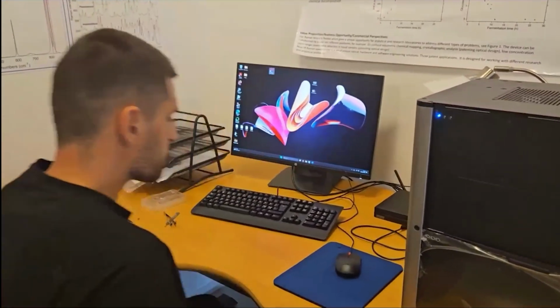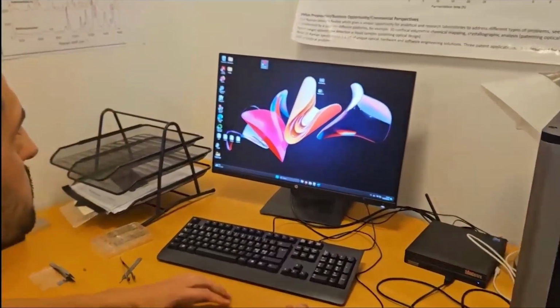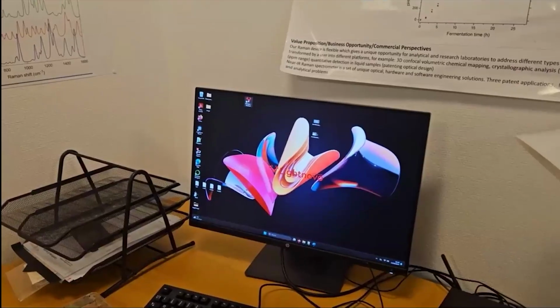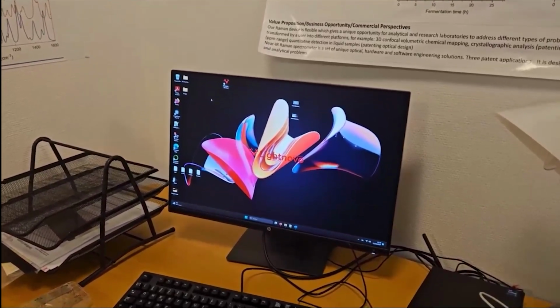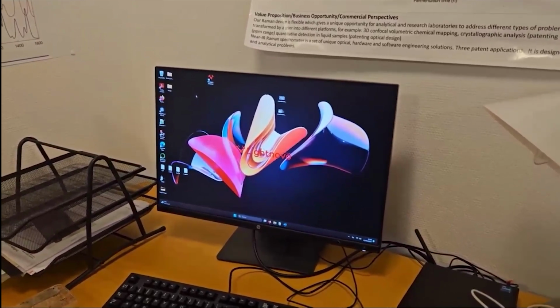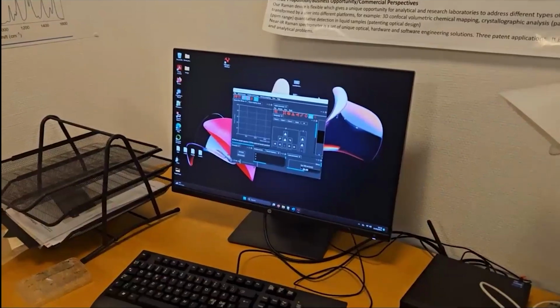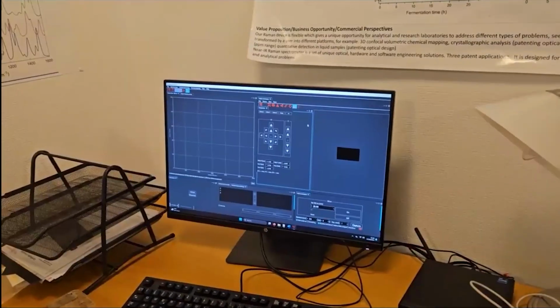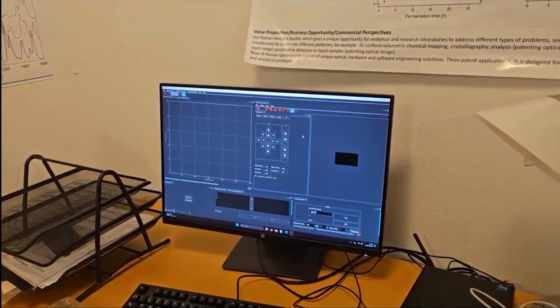So let's start the software. We click on Mirror Spec, the shortcut on the desktop. So this software is launching. Let's wait, because our software can control a multitude of different Lightnovo instruments. Here we already loaded a proper preset, the RG microscope. I don't think we need to do it again.